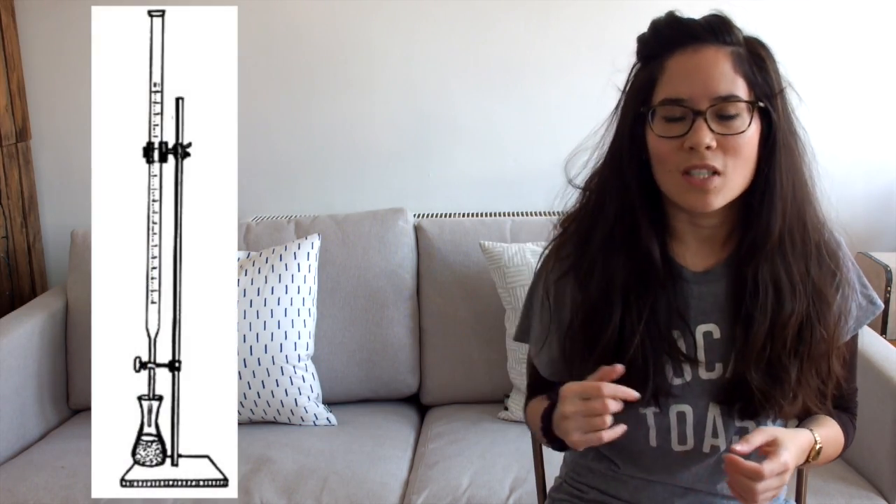All you're doing with a titration is getting an amount of acid and an amount of alkali and reacting them together until they become neutral. You're trying to work out the exact volume of alkali you need to add to that acid in order to neutralise it. That's why we use this really strange-looking piece of equipment called a burette, which is just a really long, thin measuring cylinder effectively — but it measures volumes incredibly accurately, to the nearest drop.